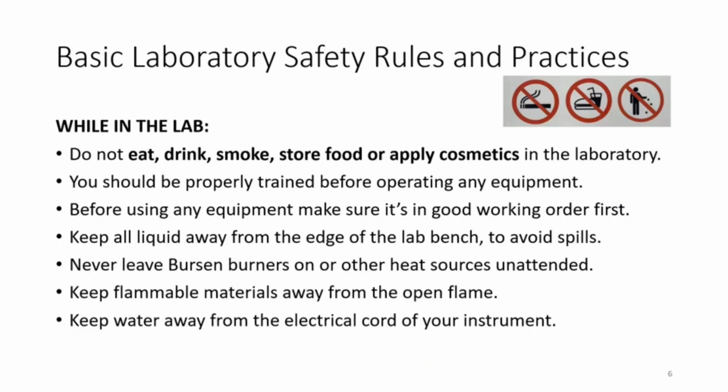While working in the lab, do not eat, drink, smoke, store food, or apply cosmetics. Before operating any equipment, you should get proper training from the lab instructor first, and make sure the equipment is in good working order. Keep all liquid away from the edge of the lab bench to avoid any spills. Never leave Bunsen burners or other heating sources unattended. Keep flammable materials away from the open flame, for example, the Bunsen burner. Keep water away from the electrical cord of the instrument. For example, do not put the instrument near the water sink.